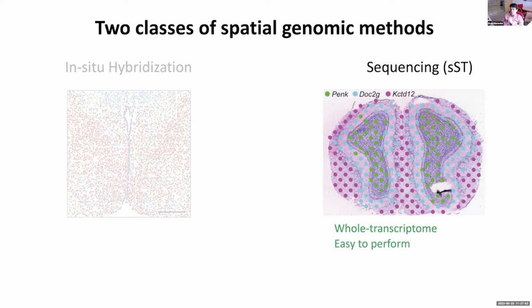Another really key aspect of these technologies is their ease of performance. They're incredibly well suited to a lab that has basic molecular biology and biochemistry experience, because essentially the slide is pre-indexed. All of the work has been done up front. I'll talk about that in a minute. And then the downstream user can treat this slide with the appropriate reagents and buffers, as if it were a standard molecular biology reaction and standard library prep. This takes a lot of the complexity and instrumentation out of these assays and makes them deployable in a lot of different contexts in biology.